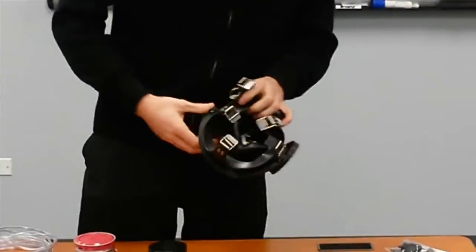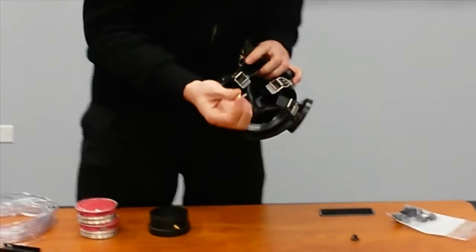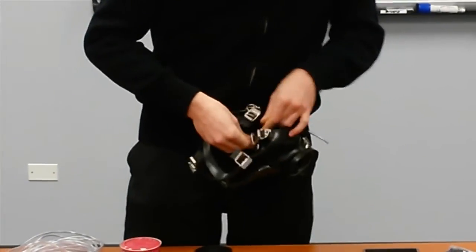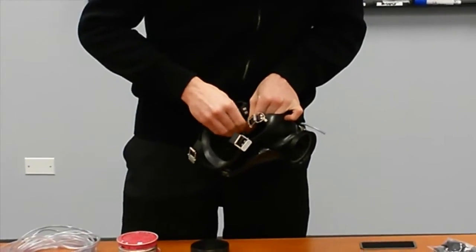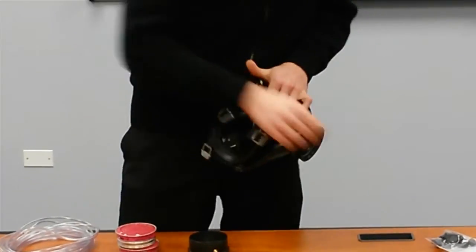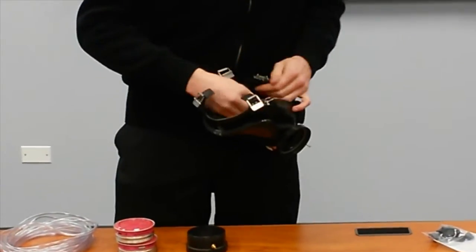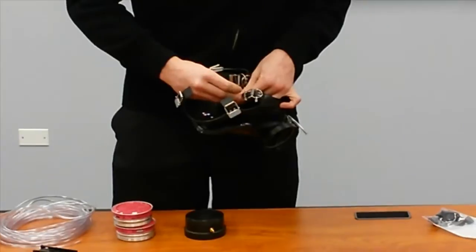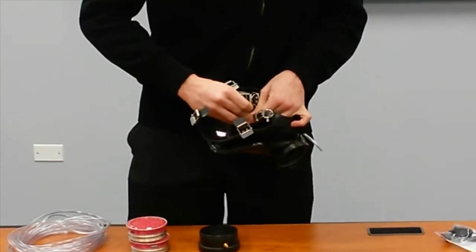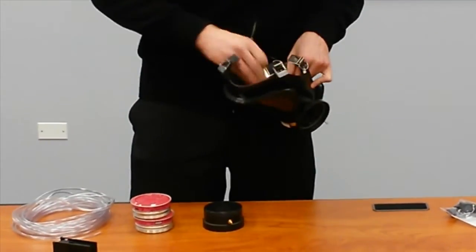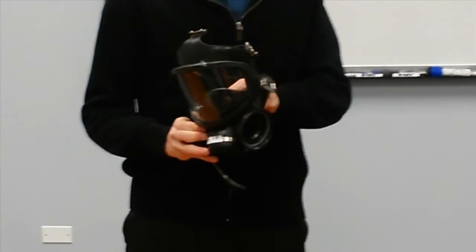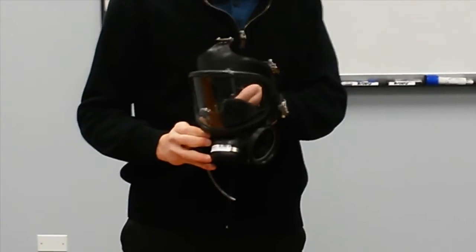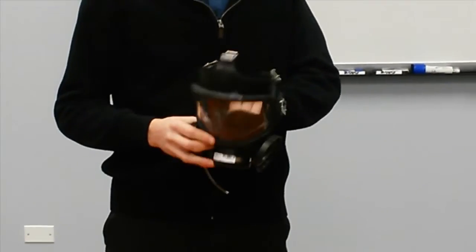Once you have that inside, you're going to take one of these clips and shove that into the end of the tubing. Once that's on the tubing, you'll take a suction cup and attach that to the clip and suction the whole thing to the inside of the mask right between the nose and the upper lip.